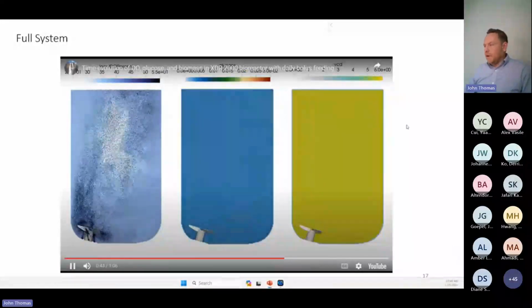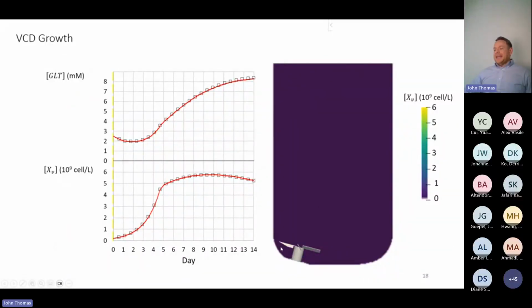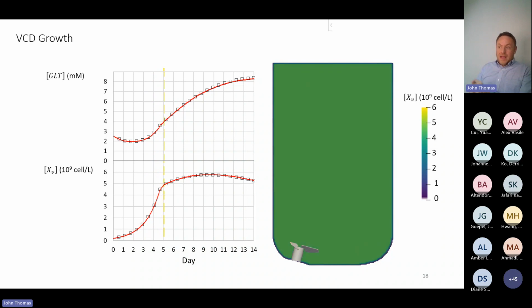And so marching on through what I get, let me go on to the next slide. Okay, I can see, for example, familiar things, like here is viable cell density and glutamine over time. So initially, I model this as a 1.4-day process. So again, I use an acceleration factor of 10. But because everything is non-dimensional, I can then scale that to a 14-day process. So I'm claiming 14 days. I modeled 1.4. My next slide will show why I think it's okay to do that.